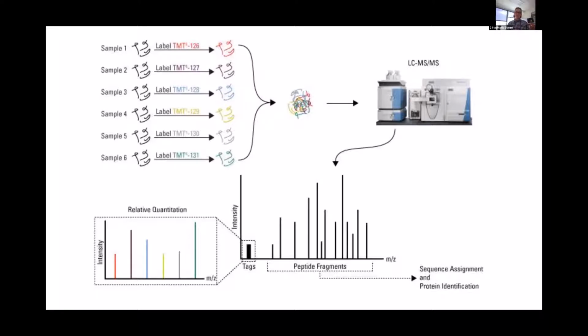The downside is, if you have 2 different TMT batches and a highly abundant peptide comes off in the 10 samples of the first batch and is selected for fragmentation for MS2, you'll get values in that first batch. But if another peptide is more abundant in the second batch, that peptide is no longer selected. So instead of just 1 sample having a missing value, now you have missing values in all 10 samples. That's why the batch effect between 2 different TMT batches is really significant, because you've compounded it by 10 samples instead of just 1.